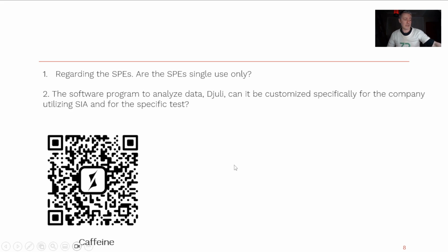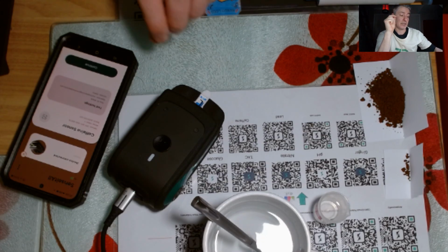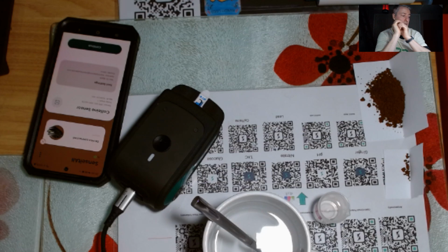Now what I'm going to do is use my app here. I'm going to scan that QR code. In fact, I've scanned it already, and so I'm in caffeine sensing. Then I'm going to scan another code in a bit and show you a slightly different version of caffeine. I'm going to do some demonstrations to talk about the flexibility of what is actually a potentiostat that works. It's really closing the gap between something you can do in the lab and something you can actually do in the real world. I'm thinking aloud a little bit, but yes.